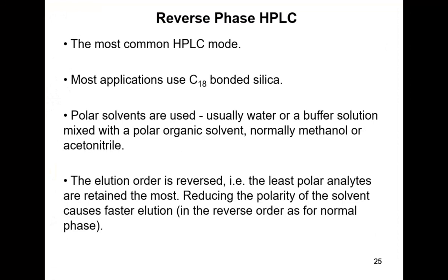Resume, and yeah, I'll say a little bit more about reverse phase HPLC. This is mostly using the C18 modification, and the practical consequence of having this non-polar stationary phase is that you need a polar mobile phase, so there's this contrast between them, and you can treat it as if it was like two liquid phases with the interface between them.